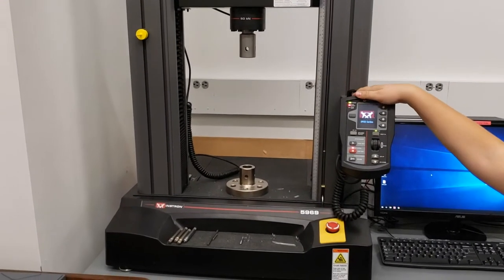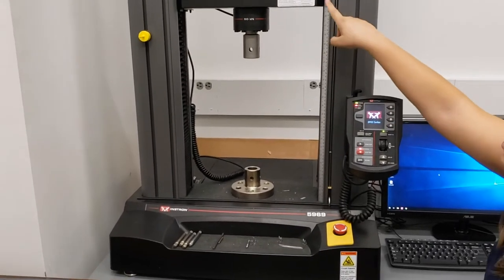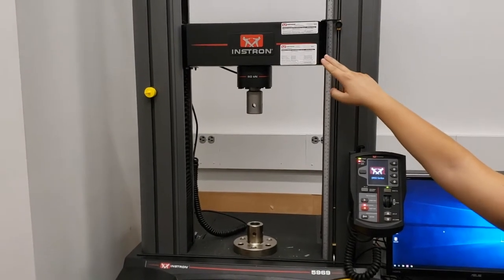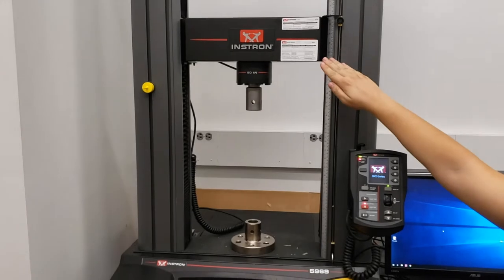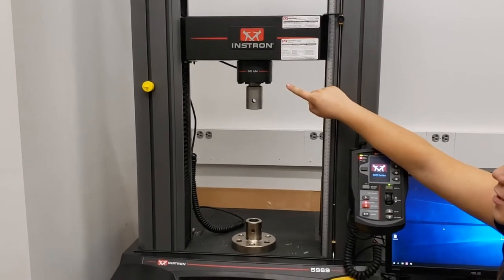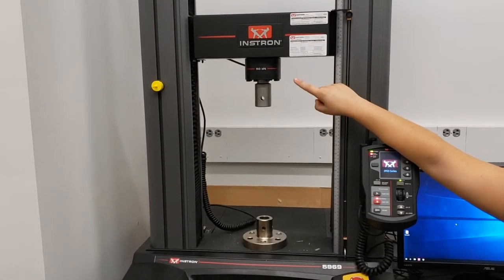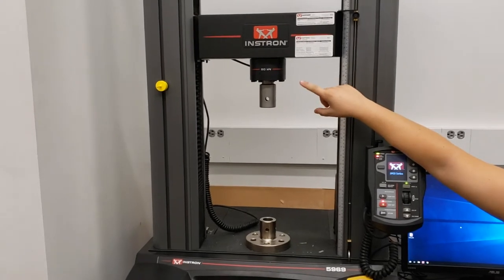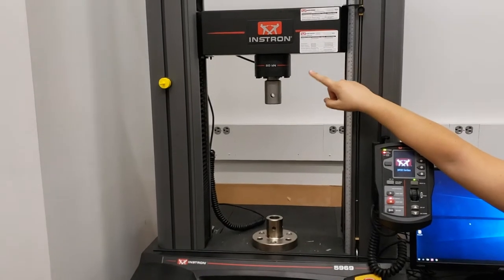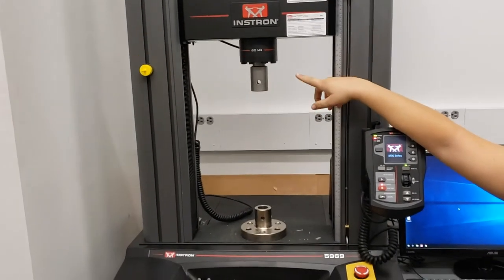This is the Instron right here. A couple of terminology things you should be aware of. This across the top here is called the crosshead — this is what provides most of the power to the mechanical movement of the Instron. Just below it is our 50-kilonewton load cell, or load transducer. This is the detector for the load or the strength, the force that we are putting on your sample. The 50-kilonewton right here is our built-in transducer, the one that stays in the machine pretty much all the time.